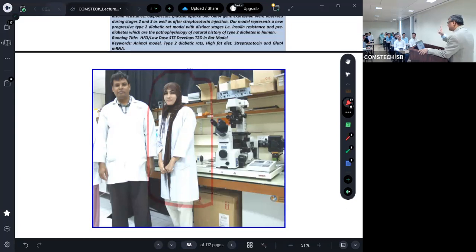Because 1 rat at night produces urine of 5 to 10 ml. In a diabetic rat, urine volume is 30 ml. That means 3 to 4 times higher. So if we put 4 to 6 rats together, there is a flood of urine. If there is a flood of urine, they cannot sleep well, and good sleep is mandatory for good health. Therefore, this is another tip. Option 1, minimize, if possible, 1 rat.